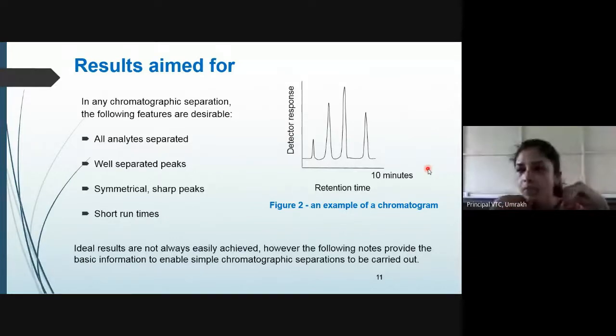We need to make changes in the mobile phase so that the component eluting at 15 minutes elutes at a much shorter time. Otherwise, every time we need to wait 15 minutes for separation, and mobile phase consumption will be more. So your method will be costlier if it consumes more mobile phase.